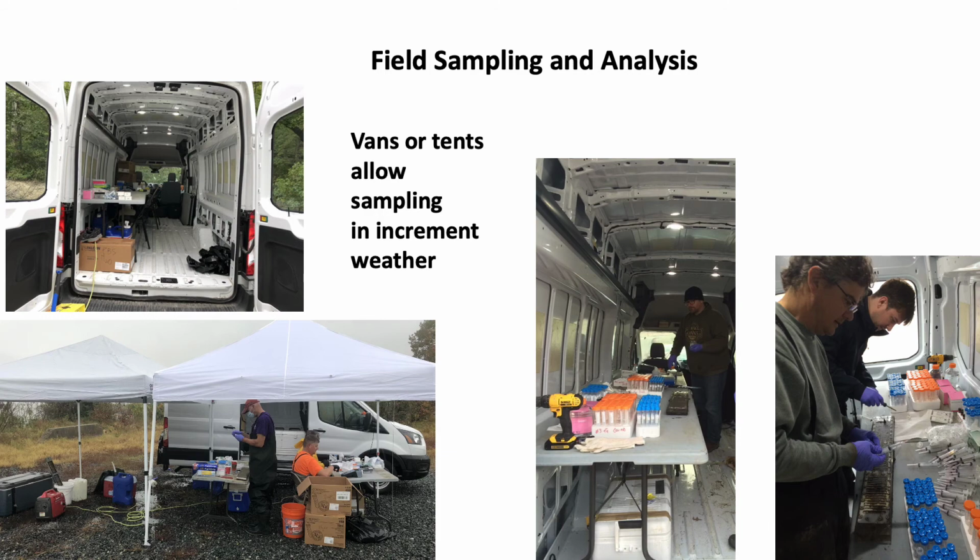Some parameters need to be sampled on site. In this picture you can see a very small device, which is a portable spectrophotometer, which is used to measure dissolved iron and sulfide, which is highly reactive and usually measured in the field.